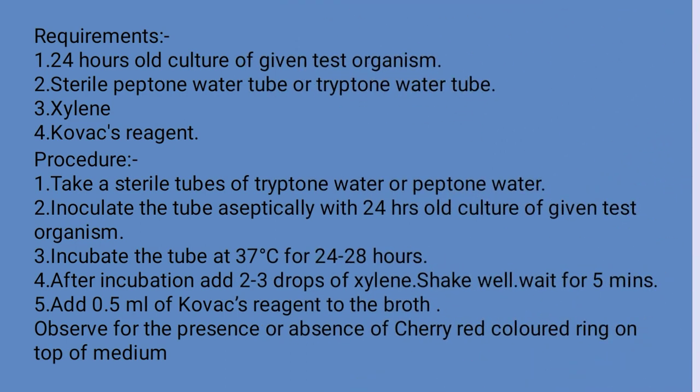Requirements for this test: a 24 hours old culture of the given test organism. If you are doing a water analysis, then you have to take a water sample. The next requirements: a sterile peptone water tube or tryptone water tube, xylene, and Kovac's reagent.